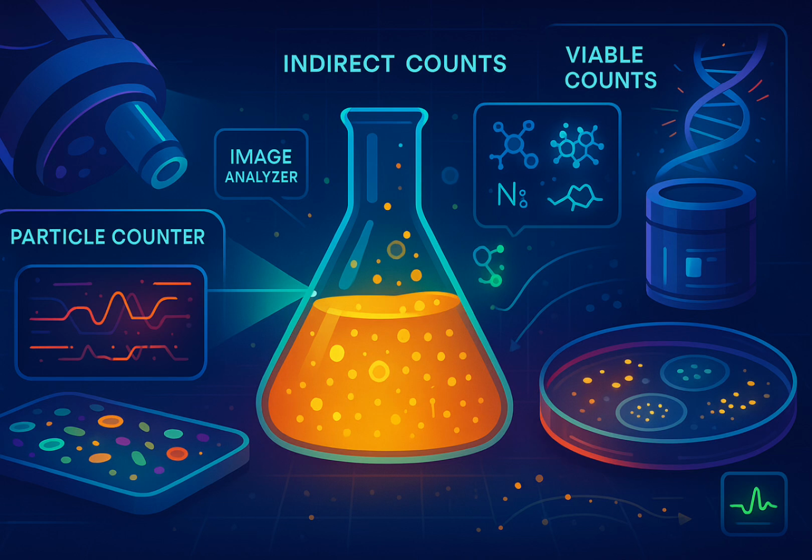Got it. But didn't you say some common fluorescent stains are not good viability indicators? Like DAPI? Absolutely crucial point and a common mistake. Stains like DAPI and acridine orange are used all the time for total bacterial counts, especially in environmental samples. They bind to DNA, and RNA for acridine orange, and make cells glow brightly, making them easy to see. But they bind nucleic acids whether the cell is alive or dead. Acridine orange might give a hint of activity sometimes by staining RNA differently, but DAPI does not indicate viability or metabolic activity. You could be counting DNA in cells that died long ago, or even just bits of free DNA stuck to particles. The sources warn that maybe only 2% of DAPI-stained dots in some samples are actually live cells.